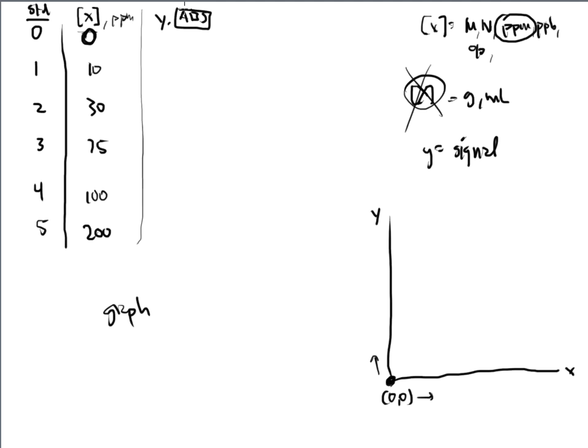And I just write those down, right? Who cares where the numbers are coming from at this point? I don't care if you know what atomic absorption is. I don't even care if you know what it's supposed to be measuring. The only thing that we need to know to make a calibration curve is the signal. I need this signal from the machine. Who cares what the machine is? Who cares what's happening with the machine? I just need the number, the report, and then I can do whatever I need to do with it. So I'm going to quickly write down some absorbance values based on these standards that I've made in the lab.